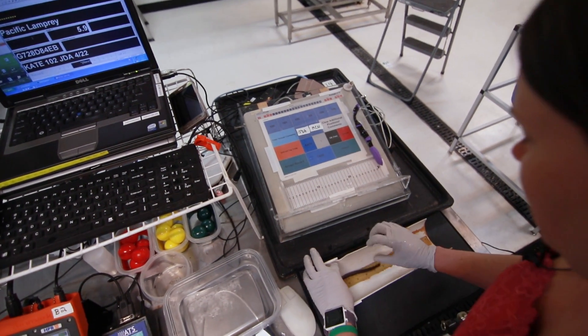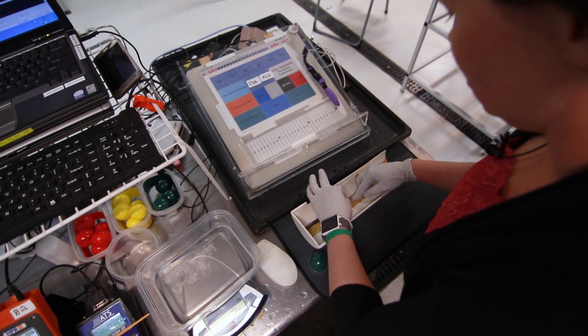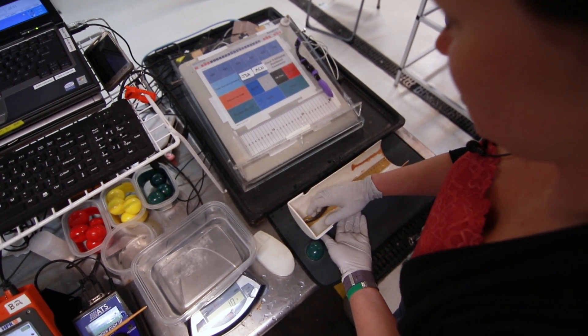I'm going to measure the length of the fish. For lamprey, we get the total length from the tip of their tail. This fish is 151 millimeters.